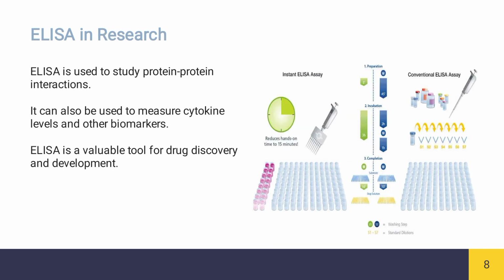ELISA in research. ELISA is used to study protein-protein interactions. It can also be used to measure cytokine levels and other biomarkers. ELISA is a valuable tool for drug discovery and development.